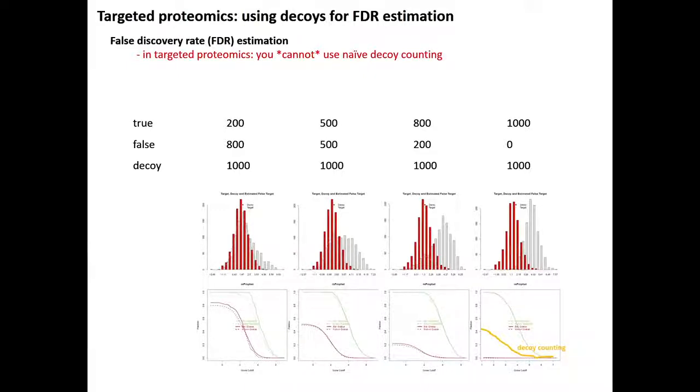If I remember correctly, mProphet originally also investigated random forest models without this providing additional benefits. If you're interested in more sophisticated approaches, there's a preprint on bioRxiv, I think it's called DIA-NN, where they replace the LDA by a neural network-based approach. I mean, IPF that George developed for phosphosite localization assessment is using a Bayesian network, right? So Bayesian models for scoring the localization. But we also made use of the LDA originally, first, yeah, and then Bayesian.